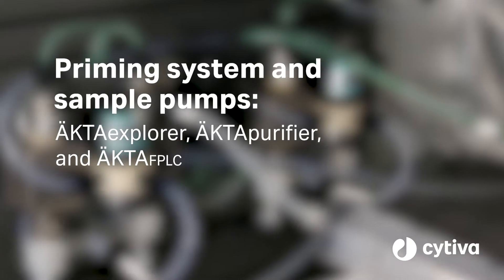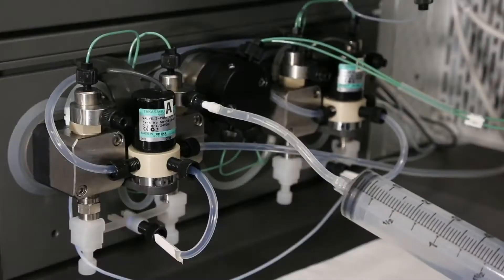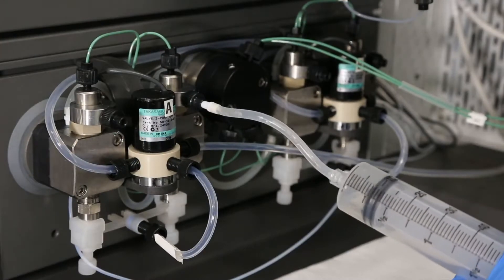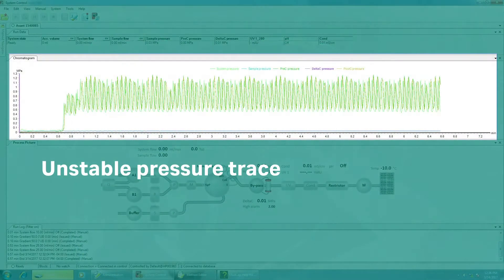Proper priming of your ECTA pumps and buffer inlet lines is essential for consistent and accurate flow. Priming will remove air in the pumps that causes uneven or pulsing flow and can result in poor chromatography performance.